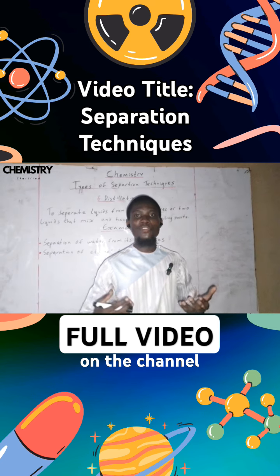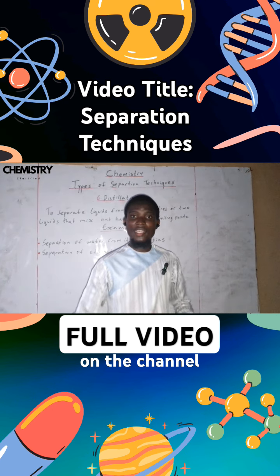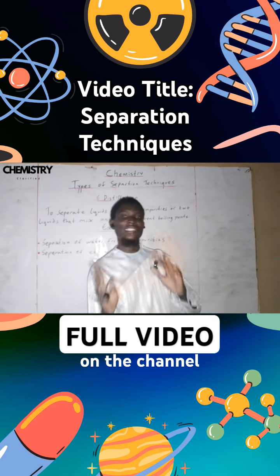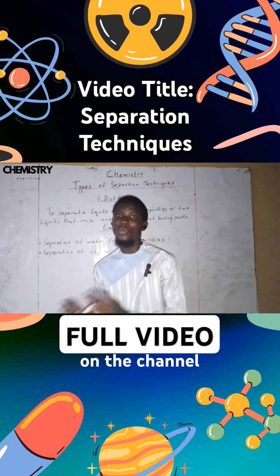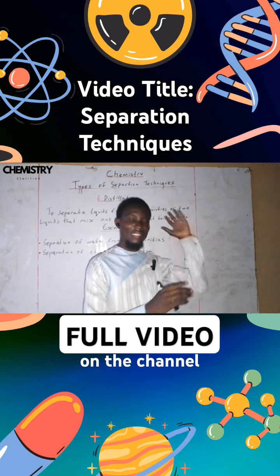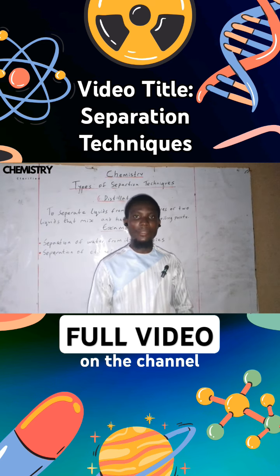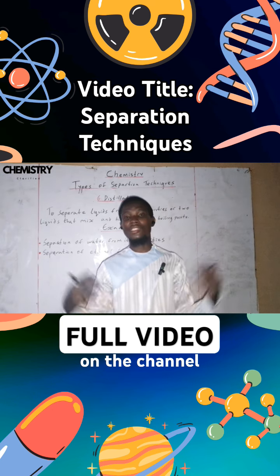When it gets to the boiling point of ethanol, ethanol is going to turn into gaseous ethanol, and then you can condense it, cool it back until it becomes liquid ethanol. Now you will be left with water. So that's how you can use this distillation to separate your ethanol from water, which are two liquids that mix. And you can also use it to separate a liquid from its impurities.